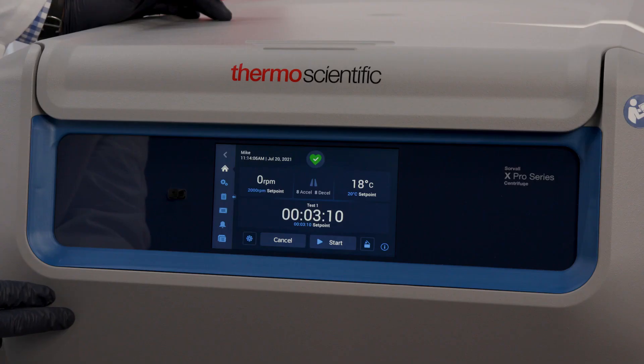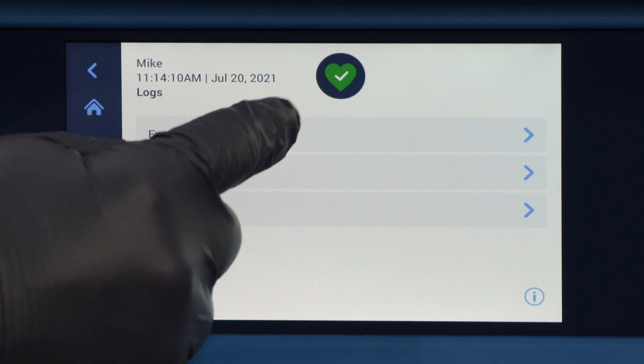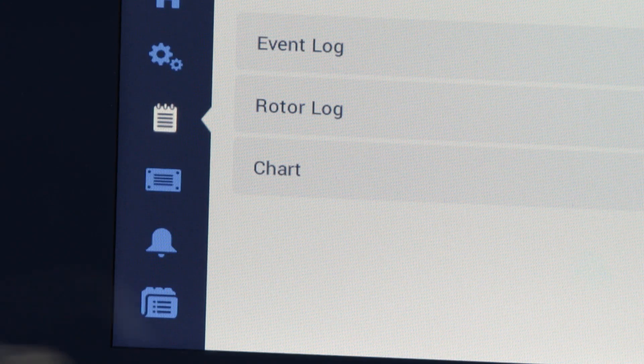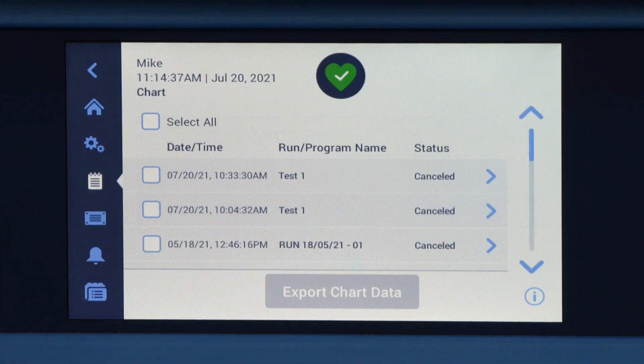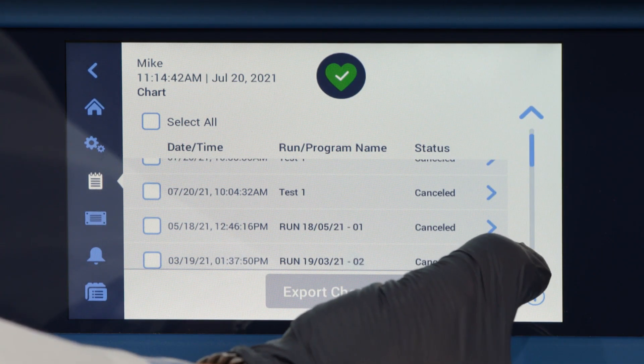The X-Pro centrifuge automatically keeps track of your rotor life and user events in the logging functions and charts every run. The chart feature will show run completion status, date, time, speed, acceleration, deceleration, and temperature data.